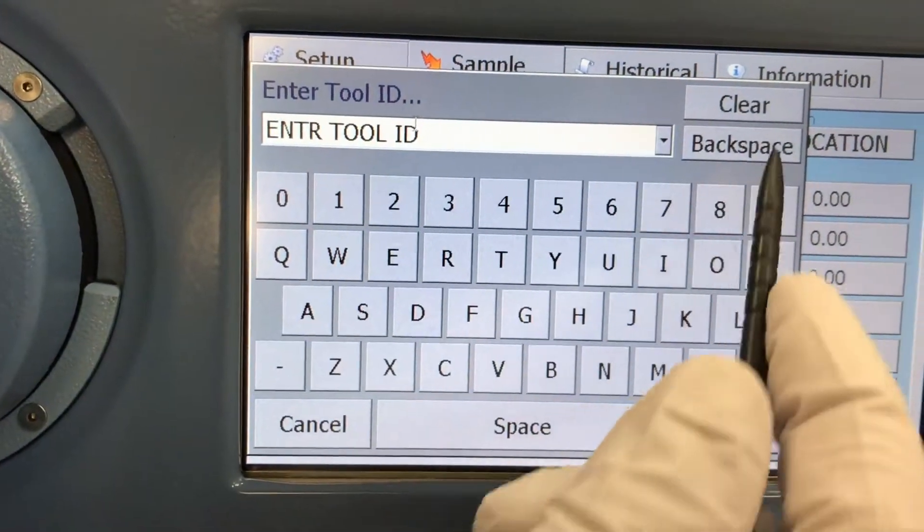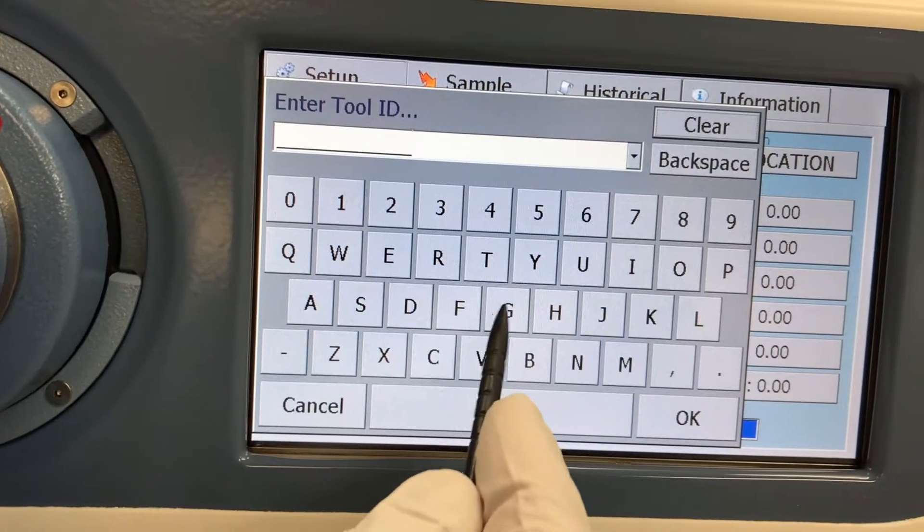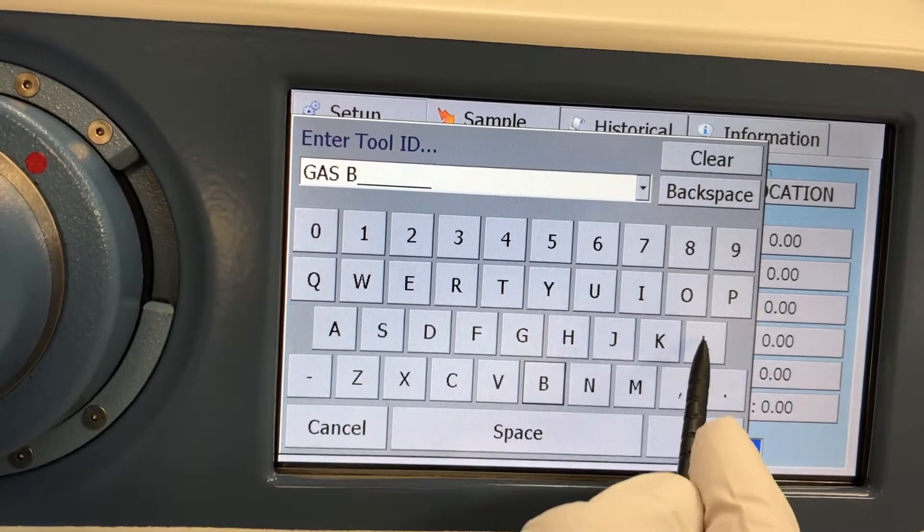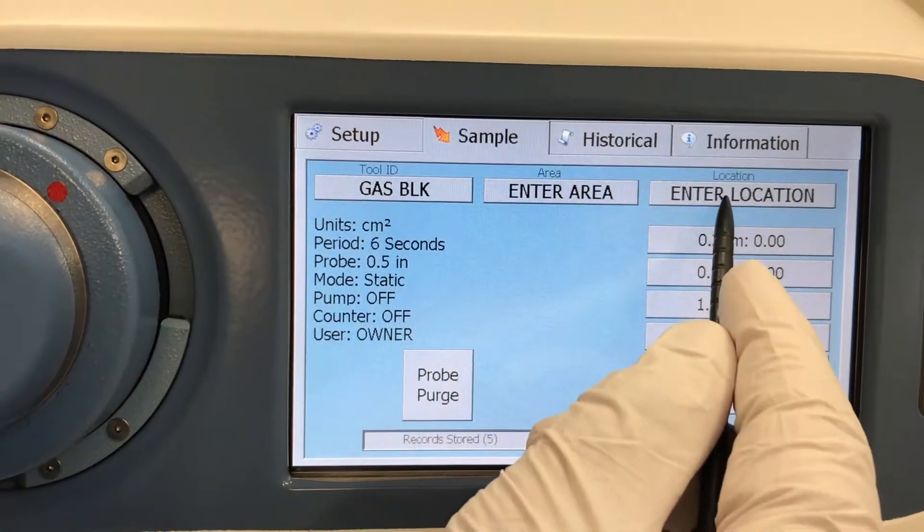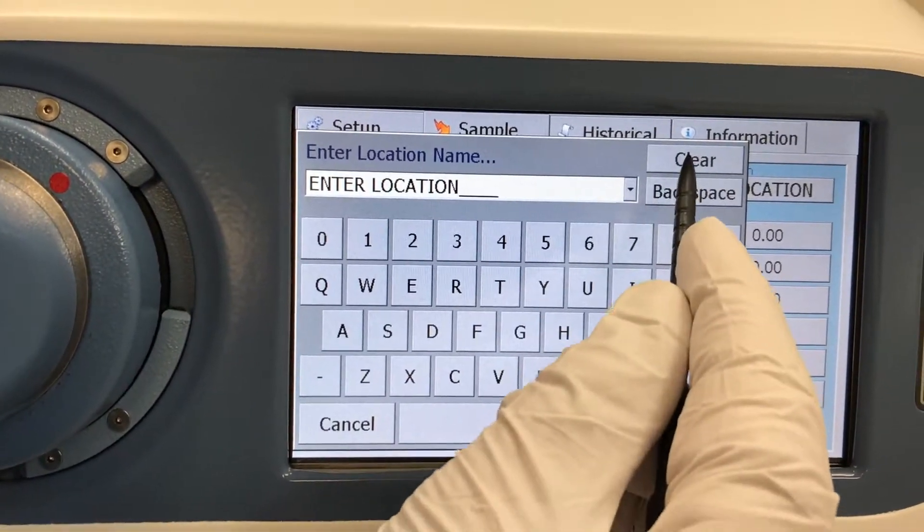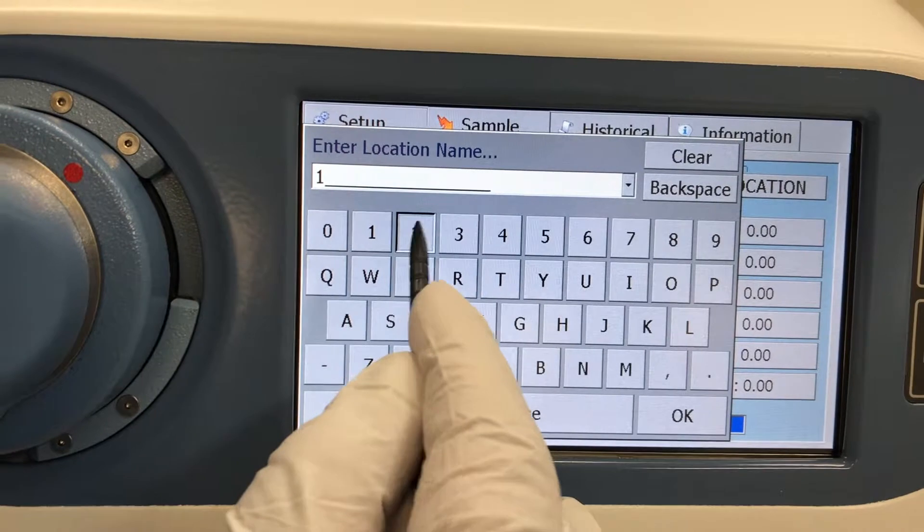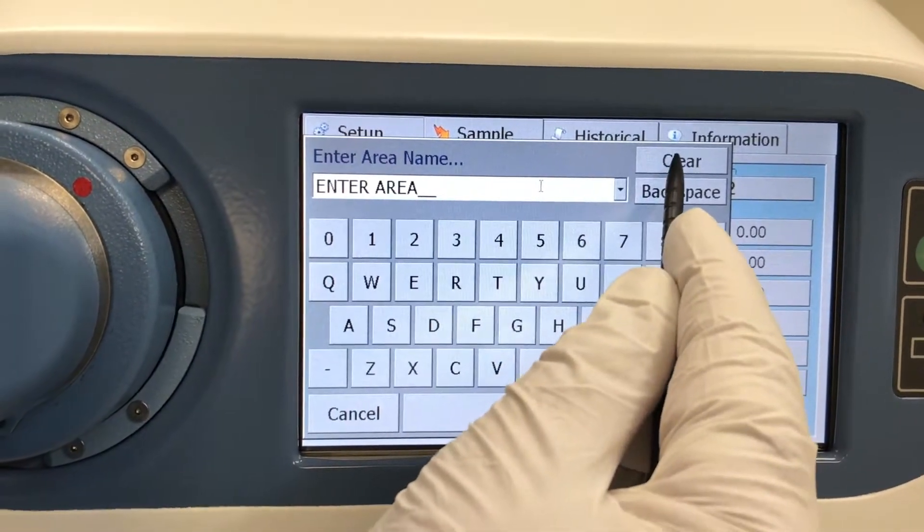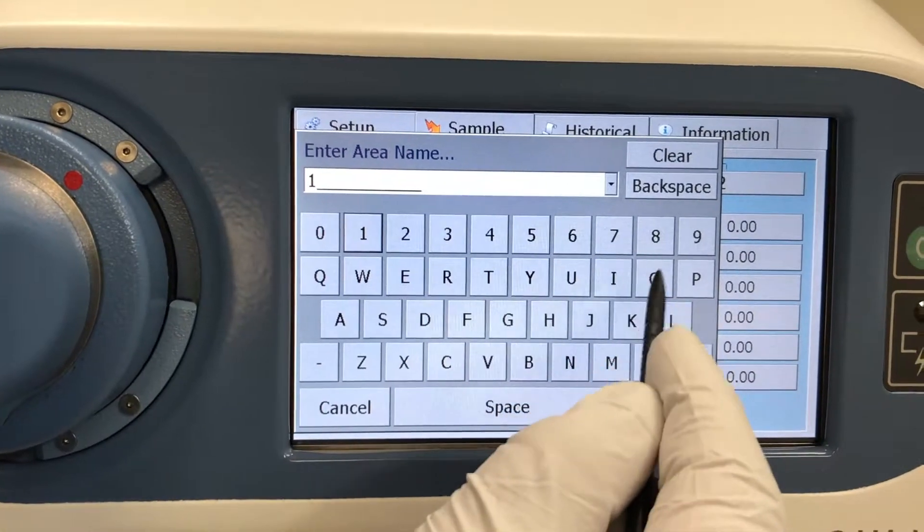Before testing you can enter information about what you are going to test. In this case we entered the part name, the date, and 12 for the 12 o'clock position on the part. You can also attach a barcode reader to the Q3 to enter serial numbers into these fields.